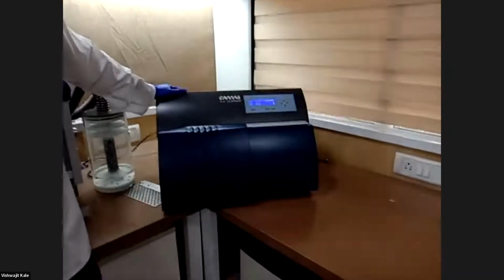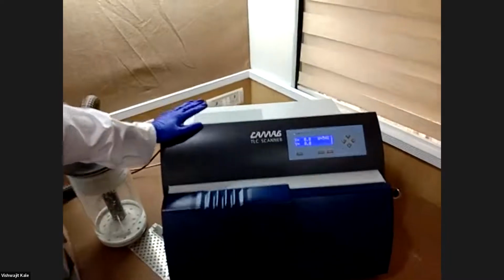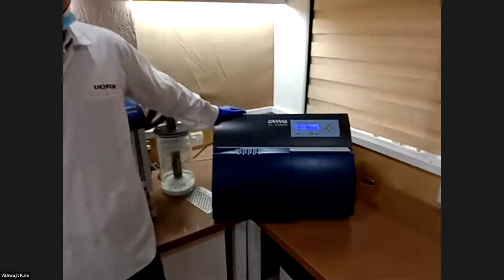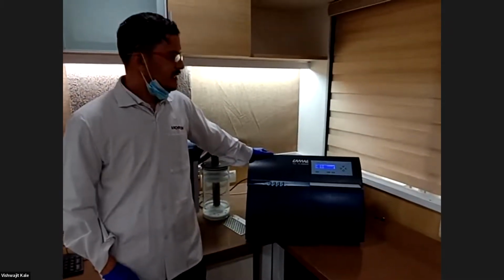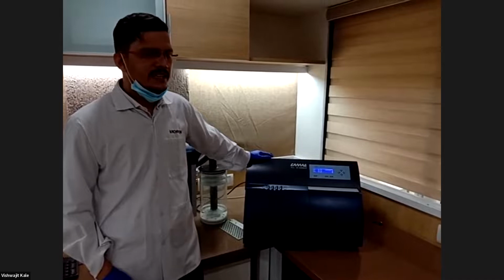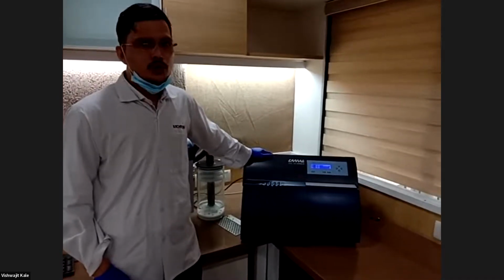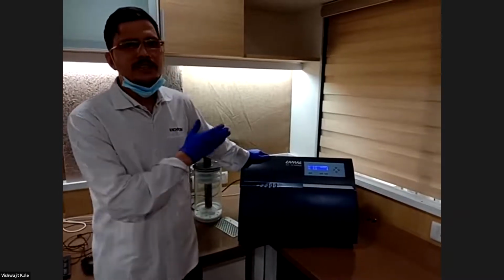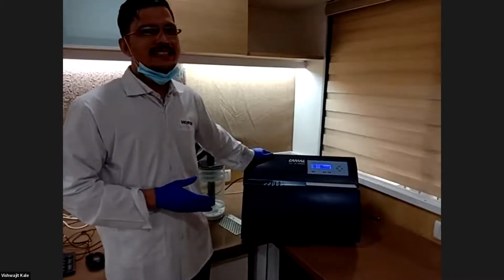This is the heart of HPTLC for quantitative analysis and spectrum analysis. We require the CAMAG TLC scanner. There are 3 lamps fitted in this scanner: deuterium, tungsten, and mercury, which will generate illumination from 190 nanometer to 900 nanometer. This scanner contains a grating as a monochromator, which will chop out any desired single wavelength. So single wavelength analysis is possible by using the CAMAG scanner.